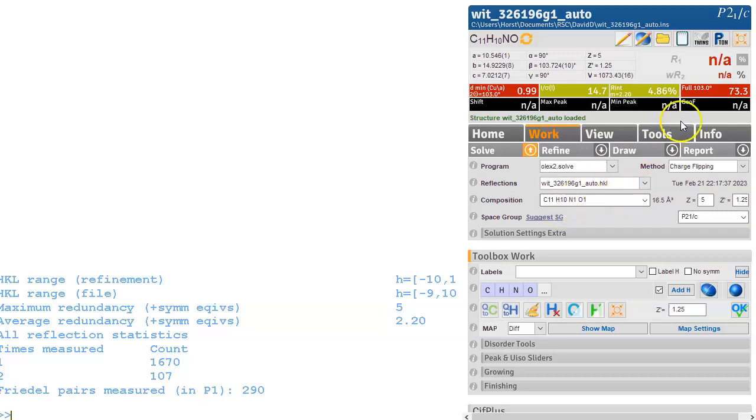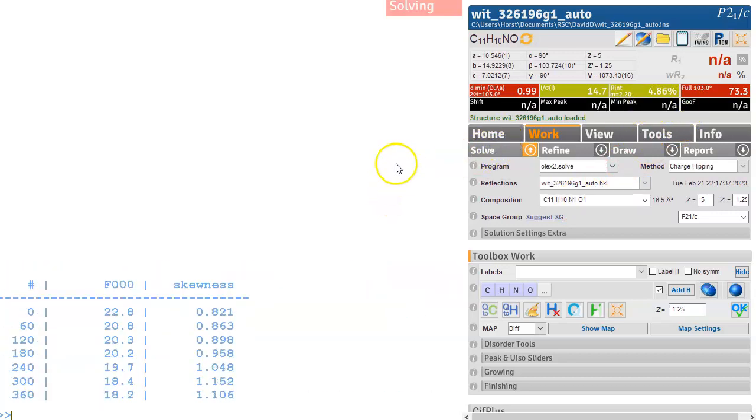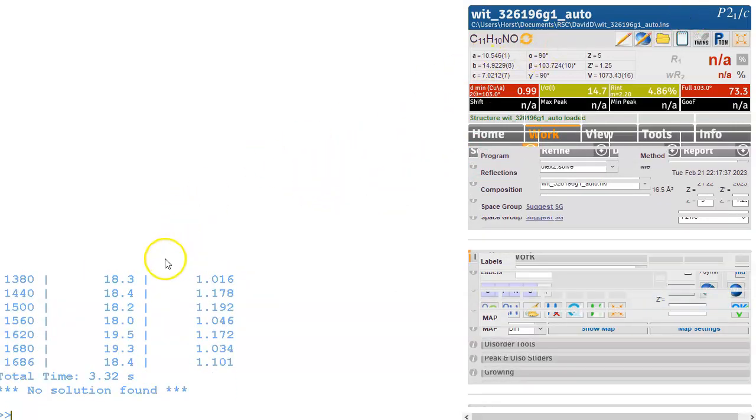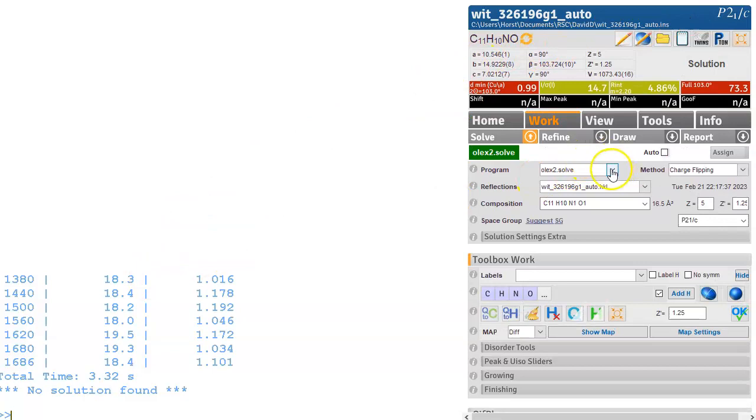So let's just use Olex2 solve, just solve it with what's on board and we click the button here. So this hopefully solves the structure given that this is quite low resolution it may not solve it. It didn't solve it.